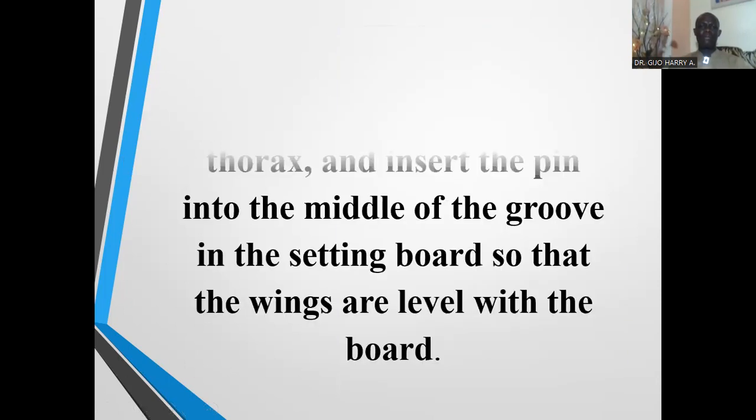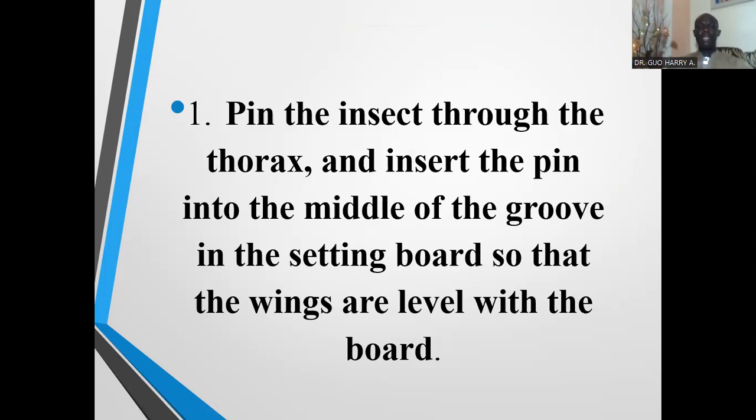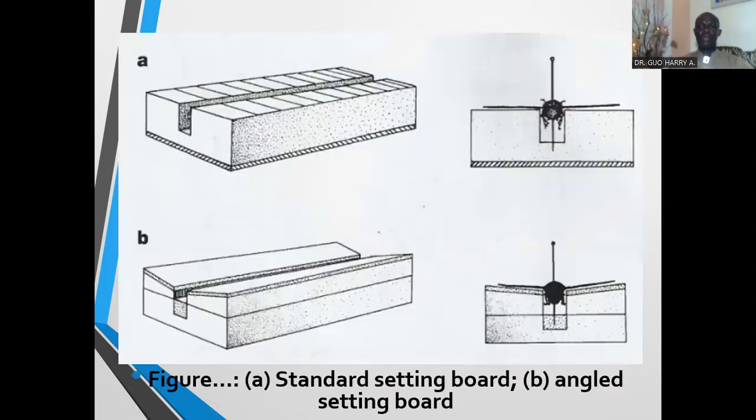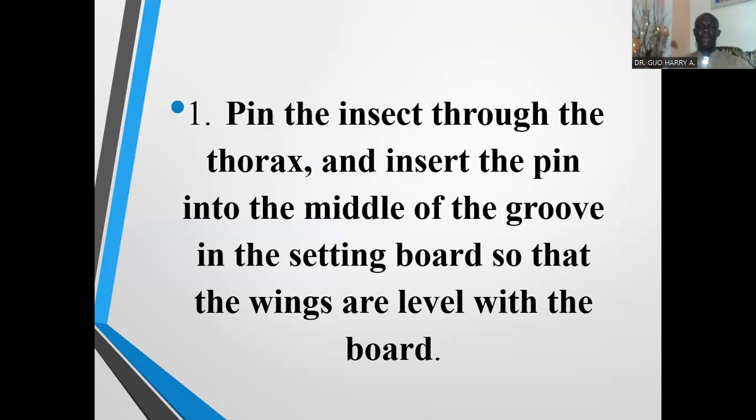Procedure for setting. The first step is that you pin the insect through the thorax and insert the pin into the middle of the groove in the setting board so that the wings are level with the board. So the insect is pinned to the thorax and the pin is now pinned through the middle of the groove, just as it is shown in this picture. That enhances the spreading of the wings.